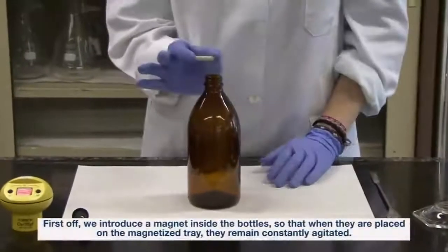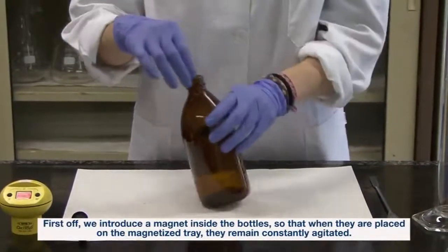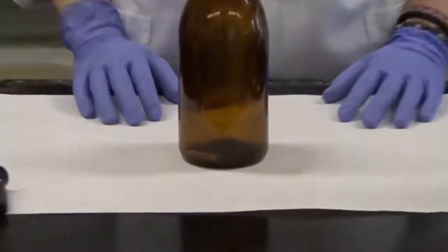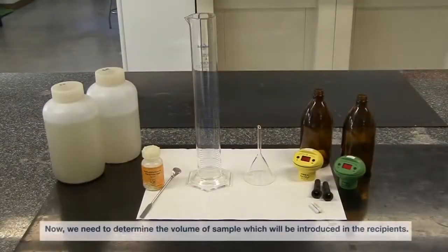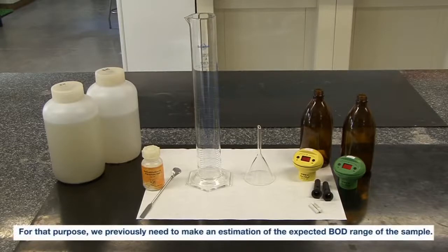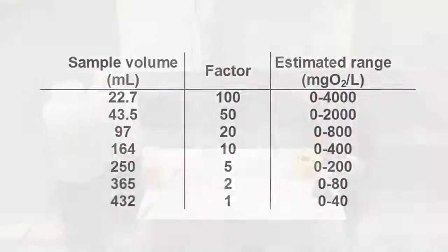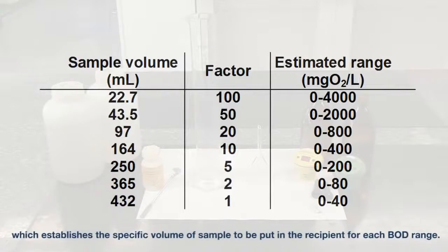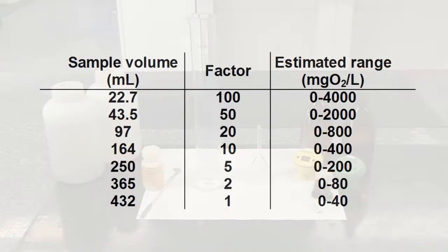First off, we introduce a magnet inside the bottles so that when they are placed on the magnetized tray, they remain constantly agitated. Now, we need to determine the volume of sample which will be introduced in the recipients. For that purpose, we previously need to make an estimation of the expected BOD range of the sample. With that information, we go to the table provided by the device manufacturer, which establishes the specific volume of sample to be put in the recipient for each BOD range.